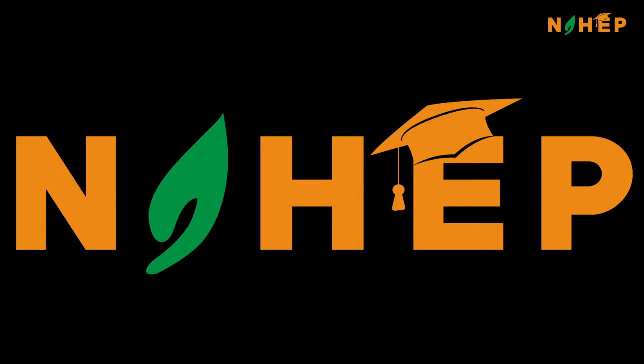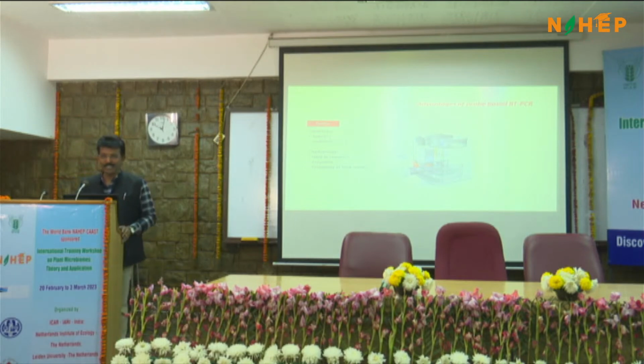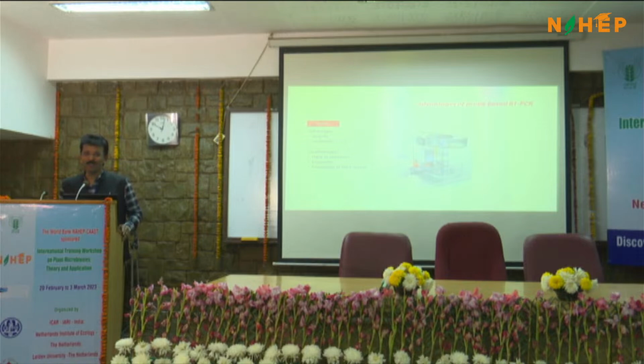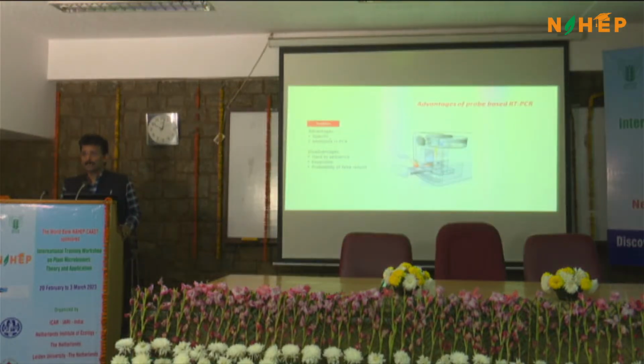Discussion of what we had yesterday. The two variants of real-time PCR: one is the fluorescent dye-based qPCR chemistry, and the other is the TaqMan probe-based qPCR chemistry. I think you understood that. I think I oversimplified it so that you all understand the secret behind how the qPCR really works. Any doubts on that before I move on? Fundamentally, one is non-specific in nature and the other is specific in nature.